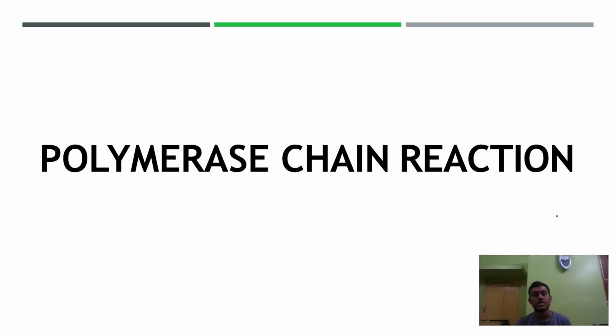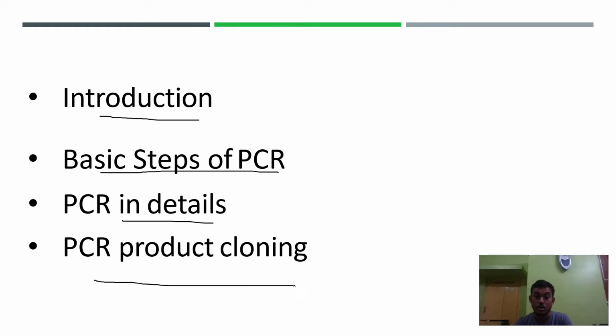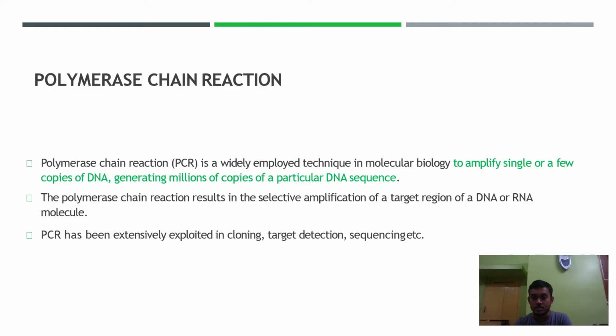Hi everyone, in this video we'll talk about polymerase chain reaction. So let's get started. We'll go through 4 pointers in this video: the introduction, basic steps of PCR, PCR in detail, and then PCR product cloning. So moving on with this.